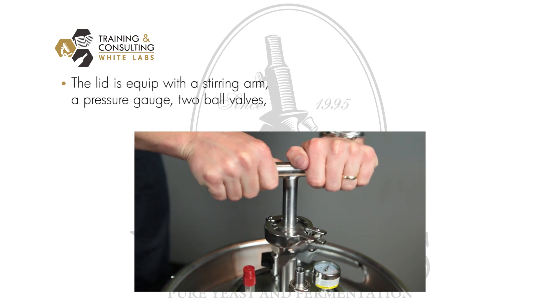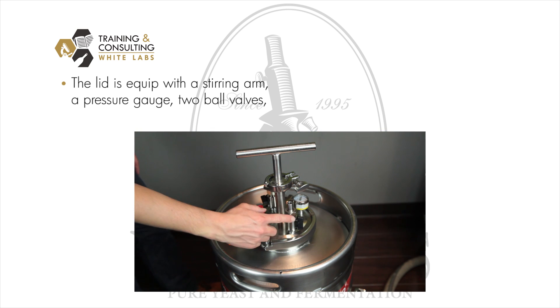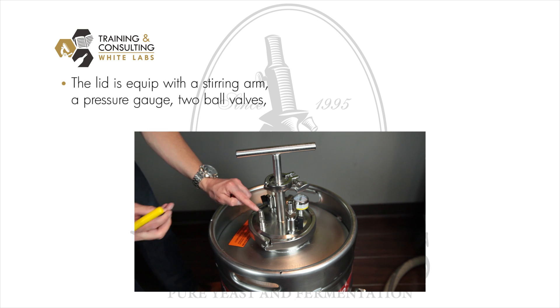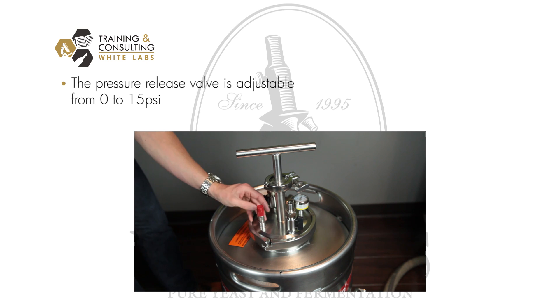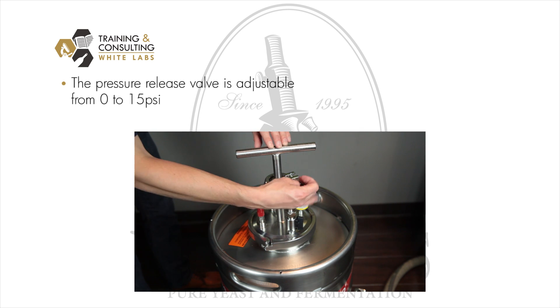The lid of the firm flask is equipped with a stirring arm reaching into the yeast slurry, a pressure gauge reading the head pressure of the vessel, and two ball valves — one with a hose barb facing down into the firm flask, and a pressure release valve. The pressure release valve is adjustable between zero and fifteen psi and is used for the different functions of the firm flask.